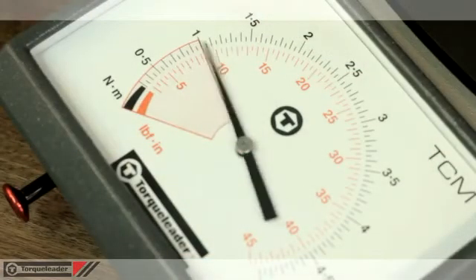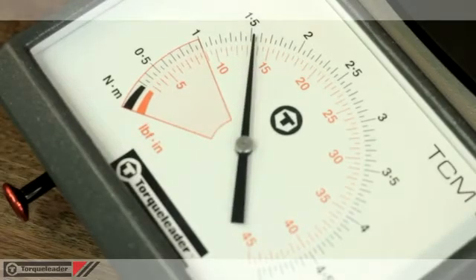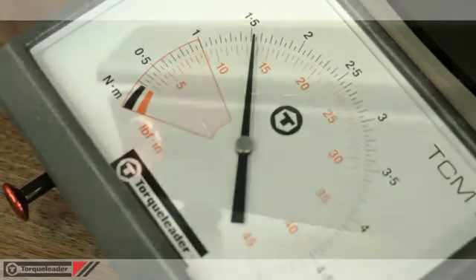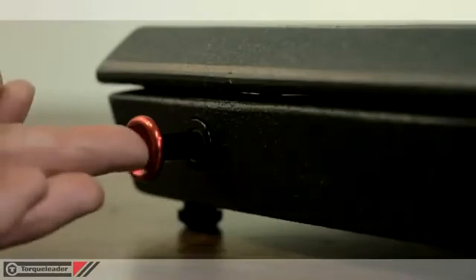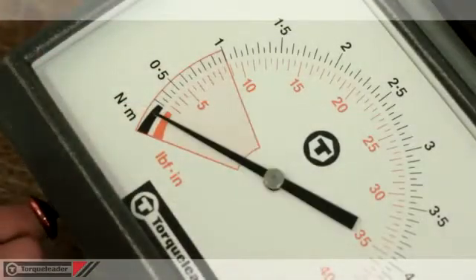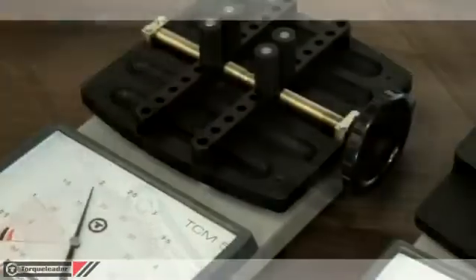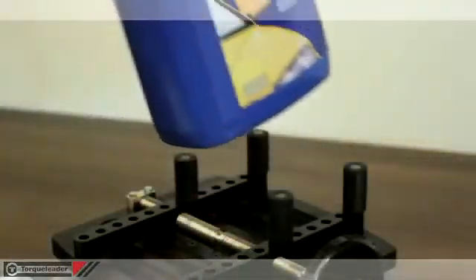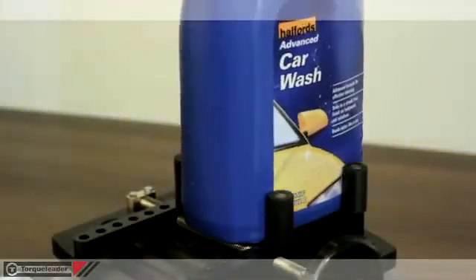The large dial features a peak torque pointer which remains at the maximum torque achieved. This is reset to zero using the button at the front of the unit. A choice of two clamping tables are available.